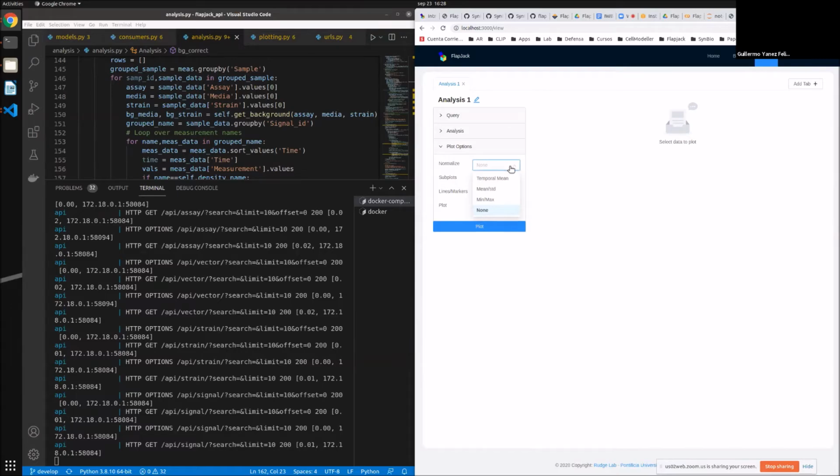As you were saying, we just have arbitrary units and we do not have calibrated units, but at least in terms of being able to compare information, we can normalize by different methods. So at least we can, for example, compare profiles that have the same shape, expression rate profiles in time. Maybe they don't have the same magnitude for different DNA constructs, but they have the same shape. So that would be used as a property or whatever.